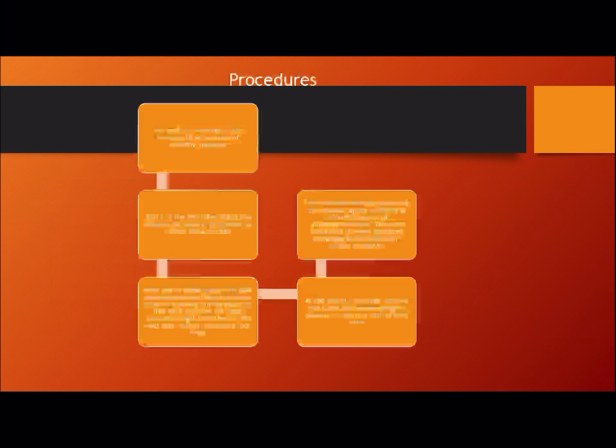Okay. So these are the procedures right here, and we are seeing that there are 3 test tubes, 2 of which will have the bromine. We are labeling the one that doesn't have the bromine so that we know which one doesn't have the catalyst. We wrap one of the tubes with dark opaque covering and place the 3 tubes in the beaker of boiling water. We want all of them to receive the same amount of light. The irradiated sample containing the catalyst rapidly solidifies as a colorless crystal of dimethyl fumarate at the end. These are the steps of the procedure.